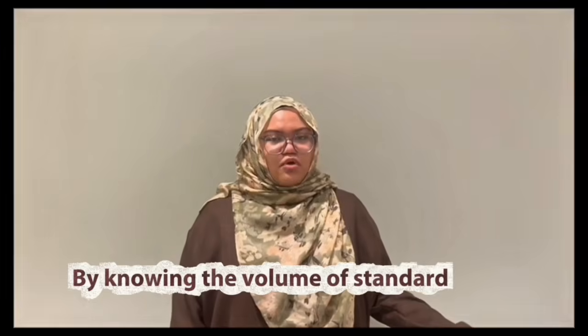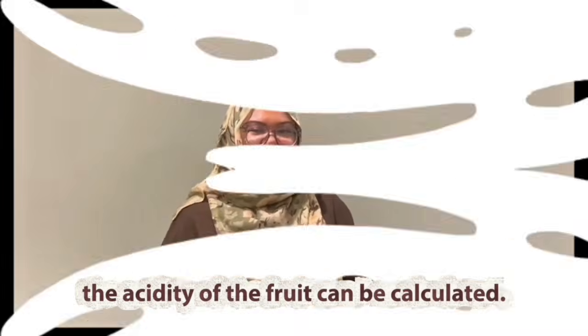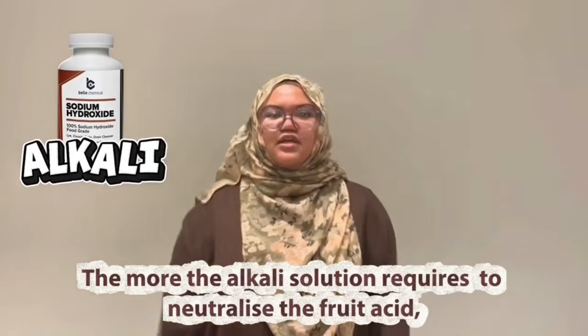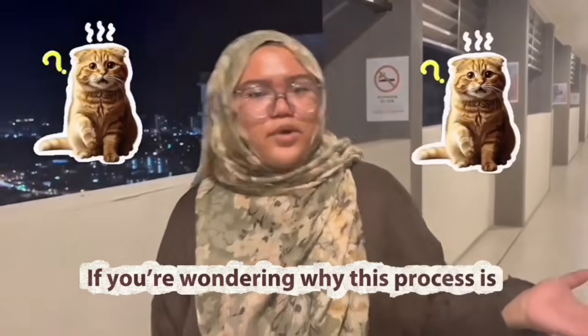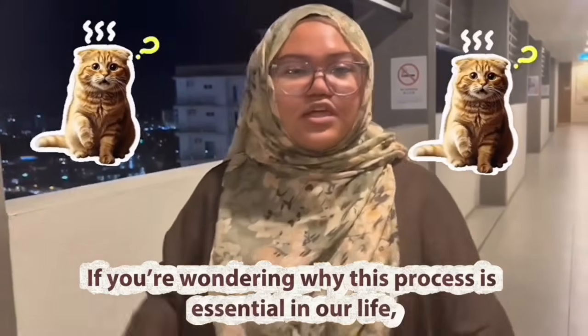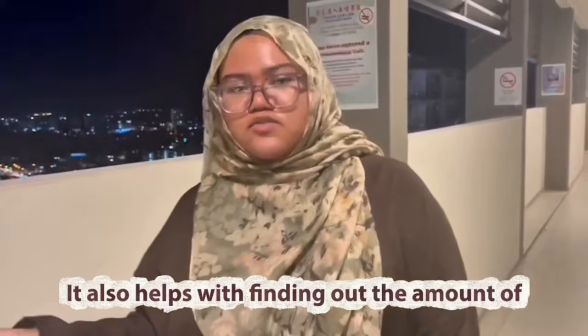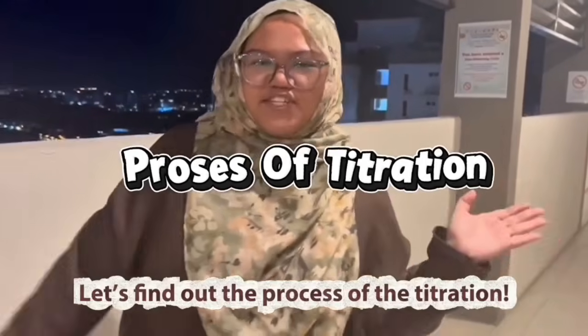By knowing the volume of standard alkali needed to reach the end point, the acidity of the fruit can be calculated. The more the alkali solution required to neutralize the fruit acid, the higher the acidity of the fruit. If you're wondering why this process is essential in our life, it is to help ensure the food quality and safety. It also helps with finding out the amount of substance such as vitamin C in food and drinks. Let's find out the process of the titration. Let's go!